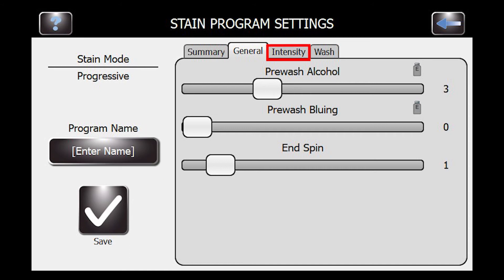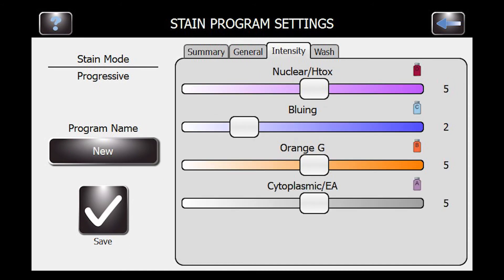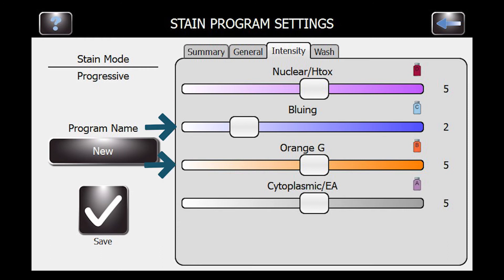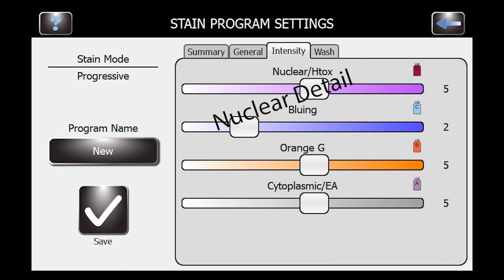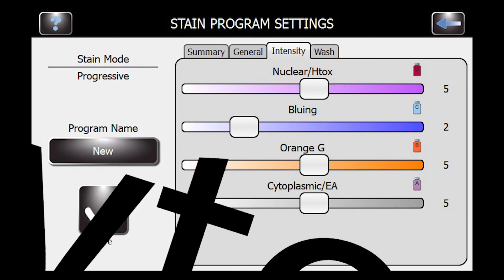Let's go to the intensity tab. Like other machines, the intensity for each stain can be turned up and down. You have the opportunity to adjust nuclear and cytoplasmic staining, as well as bluing and orange G. As you turn the H-tox up, the intensity of the nuclear staining will go up — the nuclear part of the cell will get darker. Bluing helps shift color from purple to blue in the staining process, and it works with H-tox to help get nuclear detail. Similarly, orange G and the cytoplasmic staining settings will affect the cytoplasm.